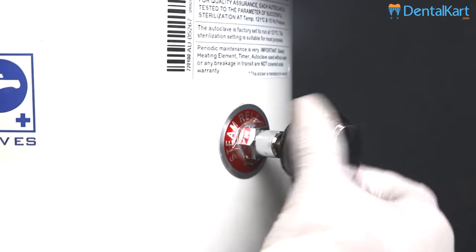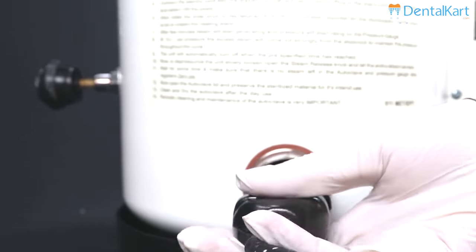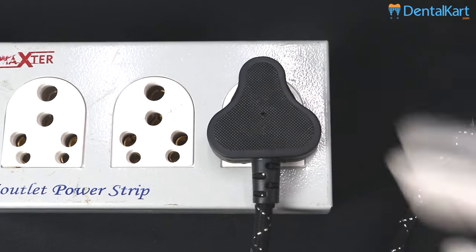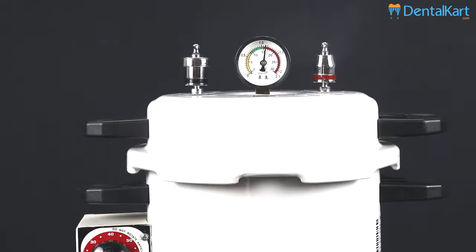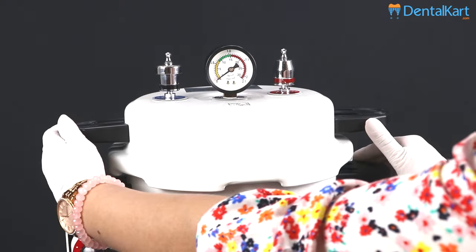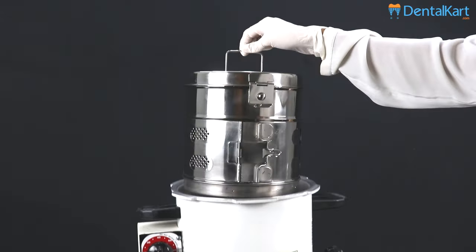Now close the steam releasing valve. Connect the cord with the socket of the heating element, then connect the power cord. Set the rotary timer. Check the pressure gauge — it has come to zero. Now remove the lid by turning it anti-clockwise. The instruments are sterilized and ready to use.